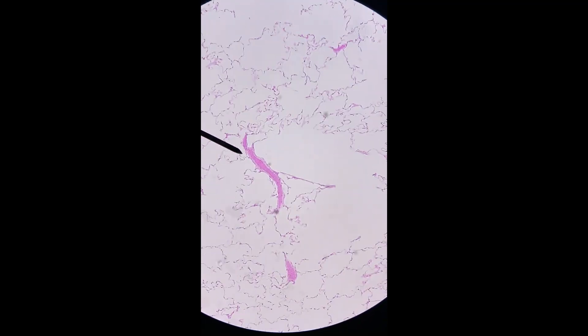Yeah, with the lung the cuts are so random, you never know what you're going to get. This shows the alveoli really well.